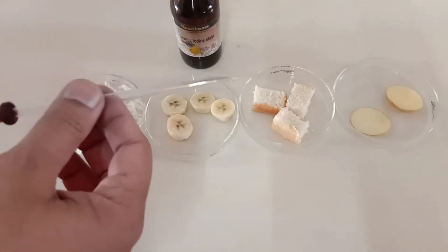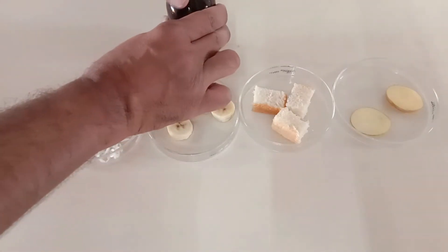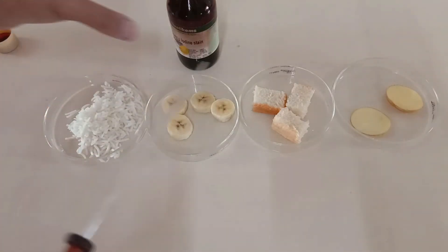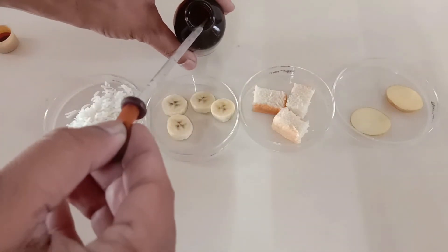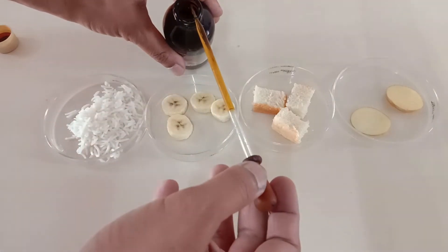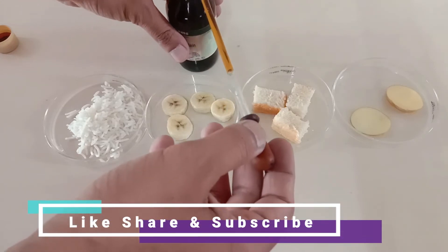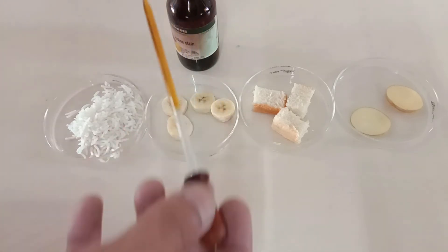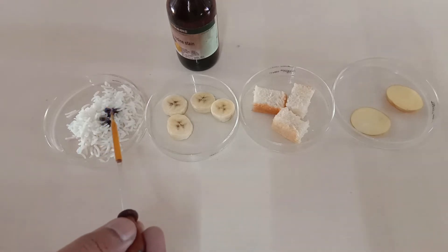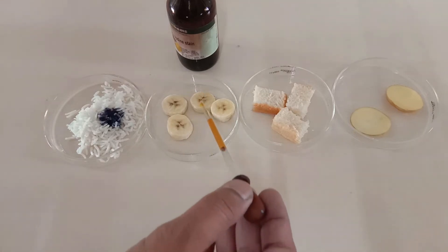Now with the help of the dropper, I am going to add about 2 to 3 drops of orange colored iodine solution to all the food items. You can notice the color of the iodine solution — it is light orange in color. You can see the iodine solution turns blue-black, which confirms the presence of starch in the food items.